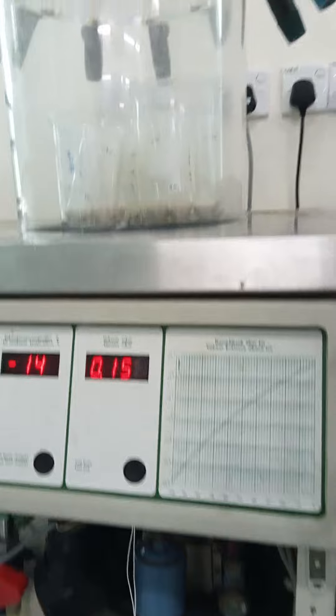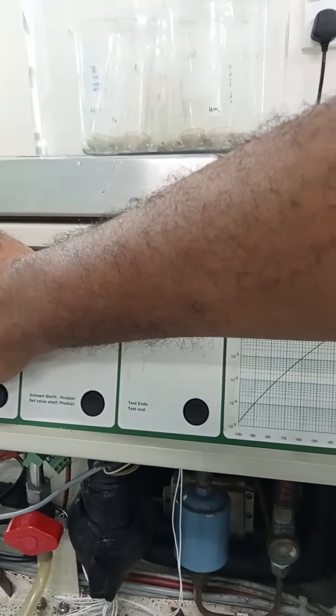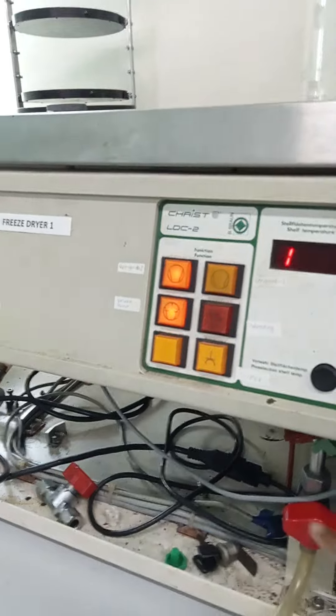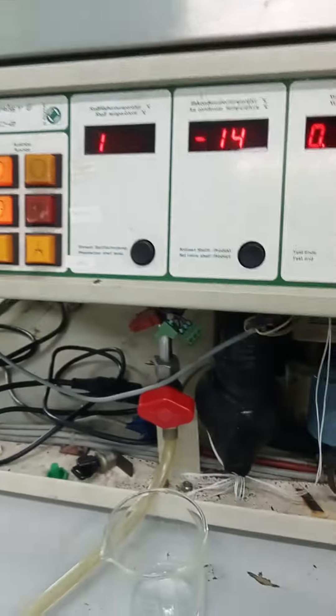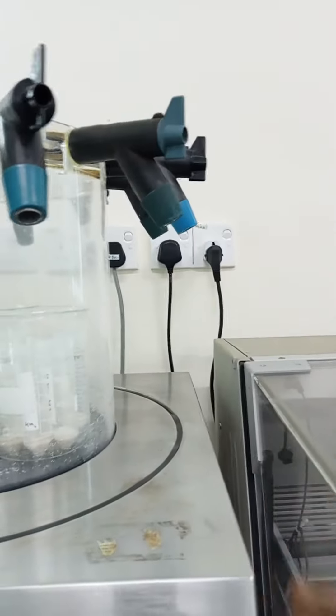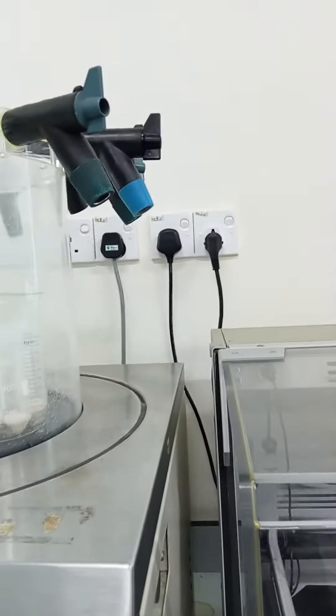Then open the vacuum, open the vacuum, okay. Then remove your sample, then close the refrigerator, and make sure this one is downward. It's in the particle, and then off the green one, and then off. Remember to write down your menu.